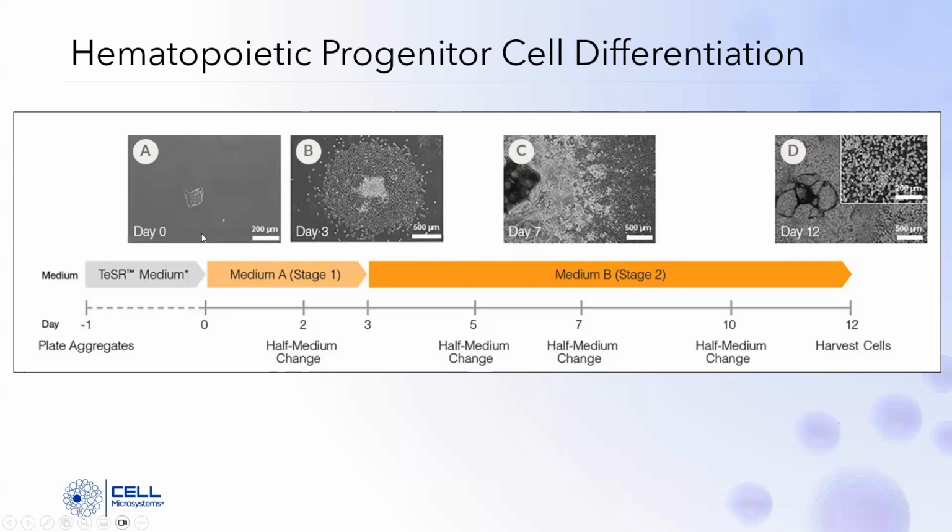The key feature of this workflow is that in order to differentiate into HPSCs, you have to generate very small aggregates of iPSCs that are of a specific size and dimension, between 100 and 200 microns. You then go through about 2 weeks of media changes to complete the differentiation process, as you are changing the growth factors in that media kit to enable the differentiation.